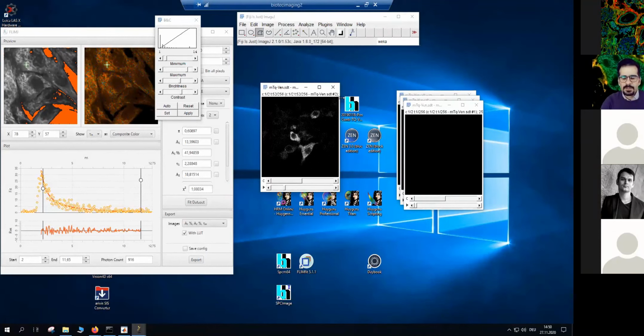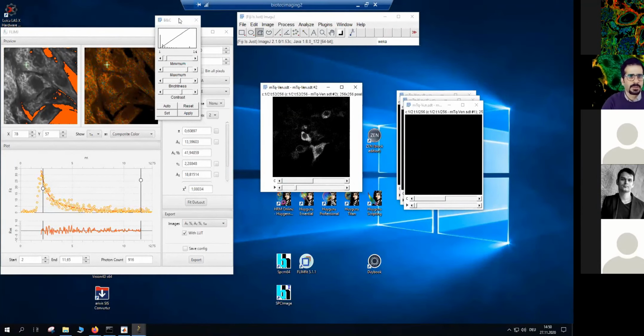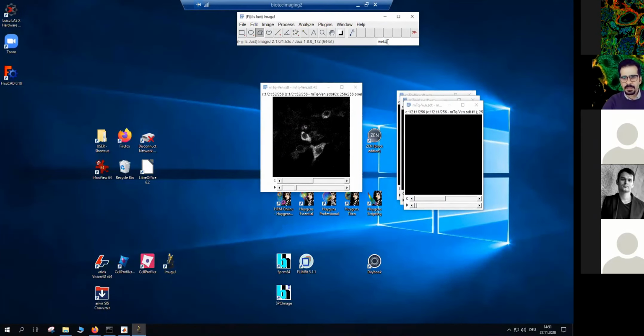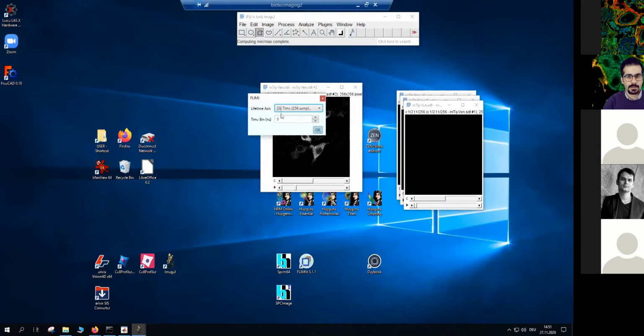Let's see what the names of them are. Exactly this is what I would like to analyze. So what I have to do again, I should close this one. I don't see any way that I can somehow click and load this image without closing FLIM-J. So I just go to FLIM-J, and see how it behaves with this 2-channel image. Okay, analyze lifetime.